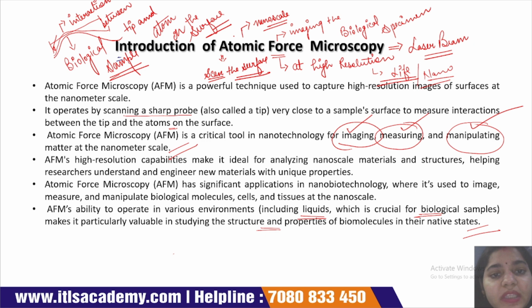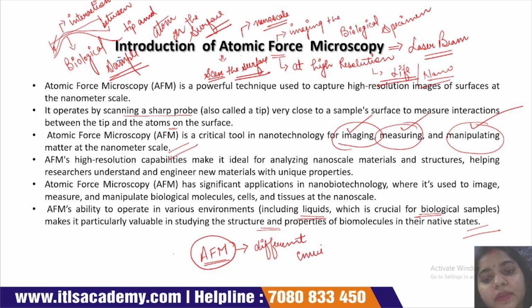AFM has a unique property: we can easily operate this atomic force microscope in different environments.